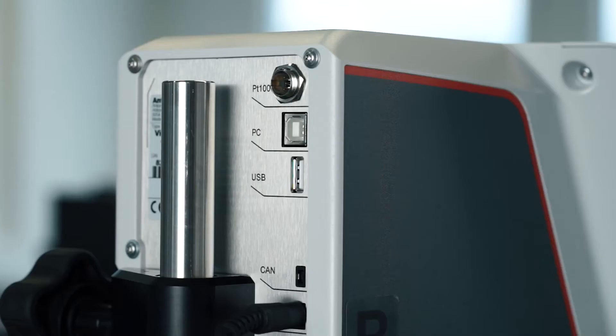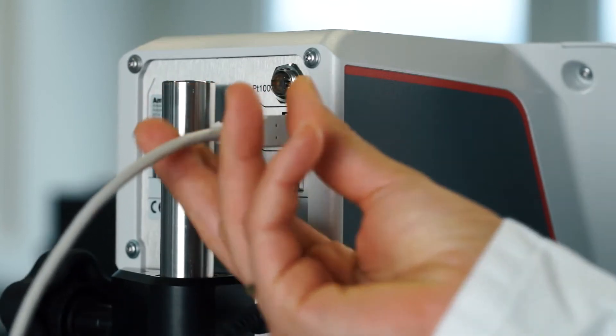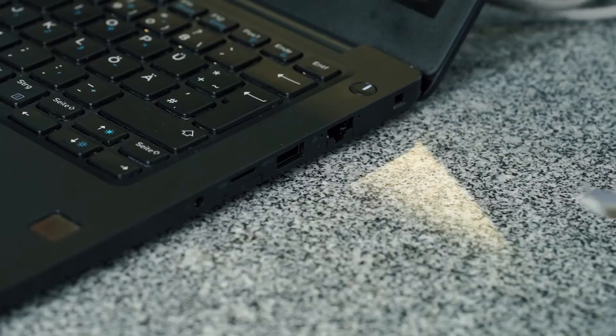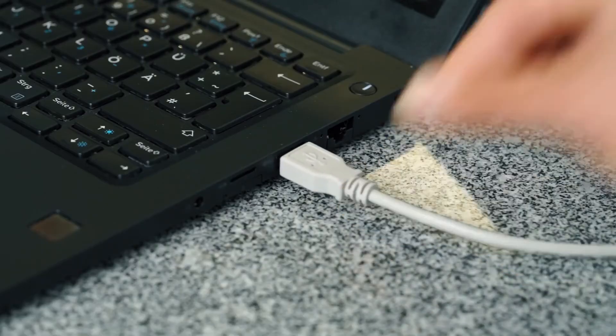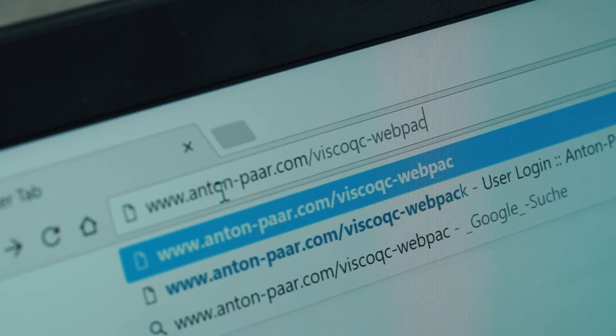If you want to use your computer to manage all measurement data, you can use the provided USB cable to connect the device. Visit our website to download the necessary data collection software, vCollect, and install it on your PC.